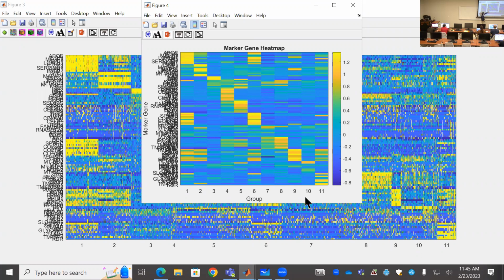So this is like a summary of the larger picture. The picture underneath looks messy sometimes, but if you use summaries, the picture may be better for publication purposes.